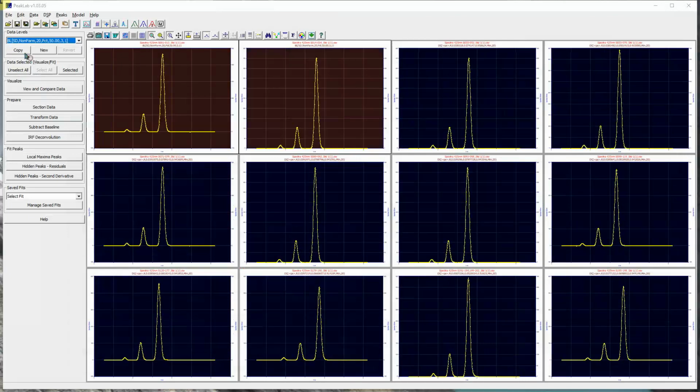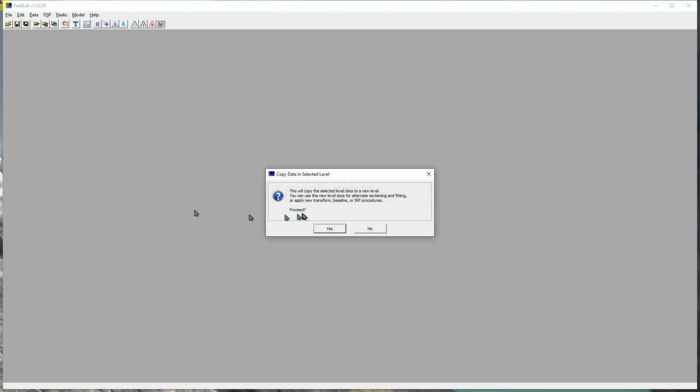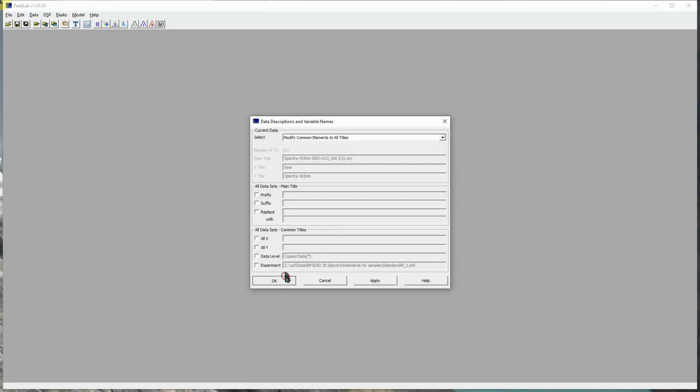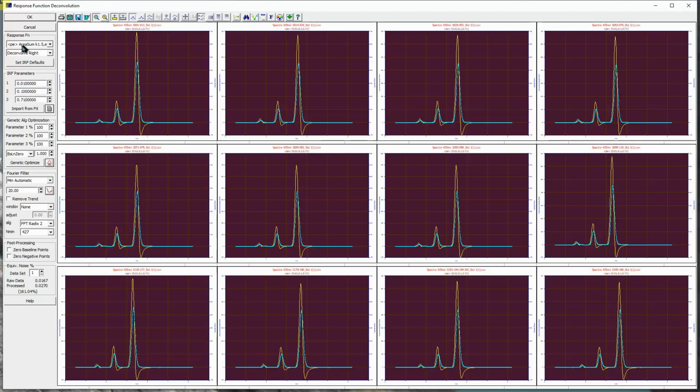I'm going to again make a copy of the non-deconvolved data. We're going to go out to the IRF deconvolution, and we're going to look at the PE IRF. Horvath and Lin years ago, when they were looking at the mass transfer resistances in a system, found one of the rate steps was higher than first order.